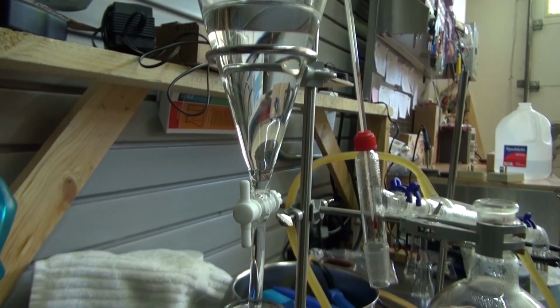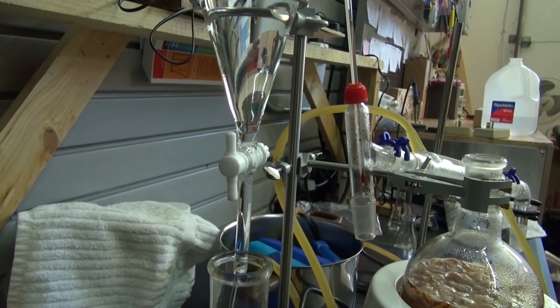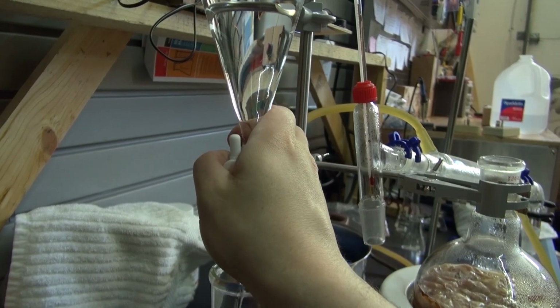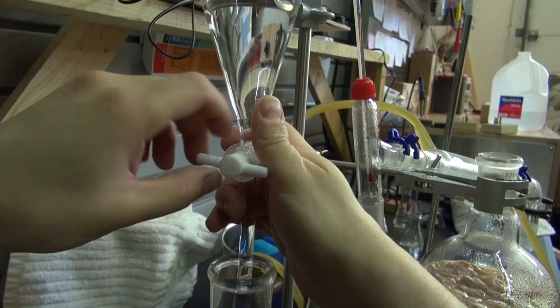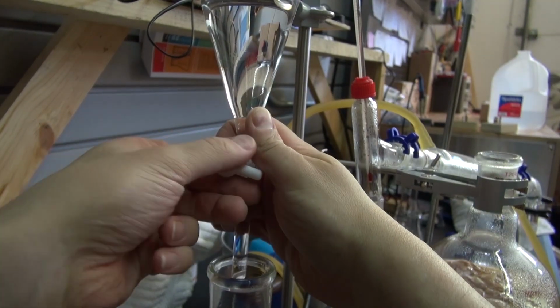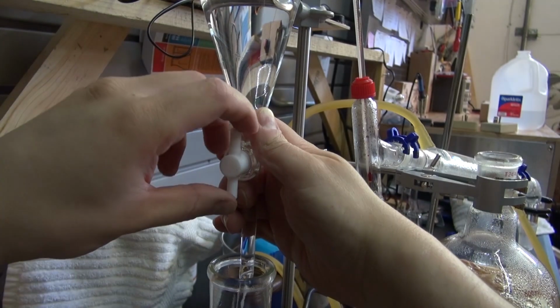Okay, so I've turned the valve on the separatory funnel, and I'm going to see if I've collected any rose oil. Now as you can see, my Florence flask still has my final batch. That's because I accidentally left the room and let the water boil out and I burned the rose petals. So instead, I'll have tar mixed into the solution, and I don't want that. And it smells really, really bad. So unfortunately, I'll just deal with just this batch.